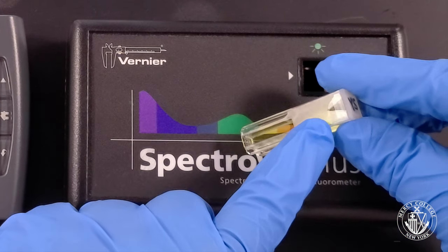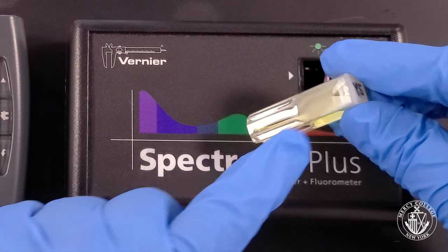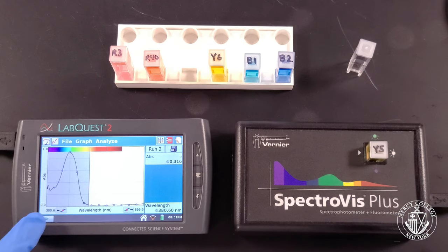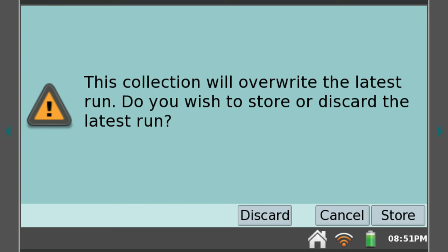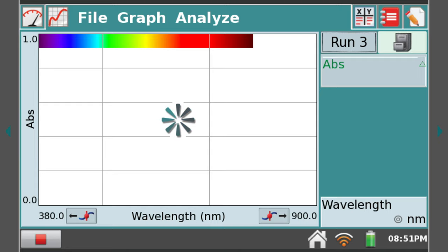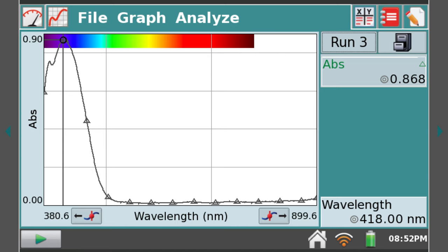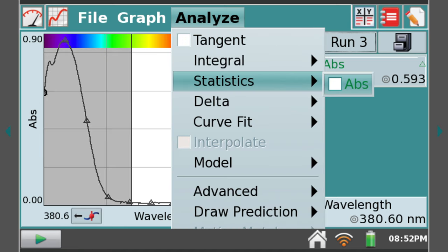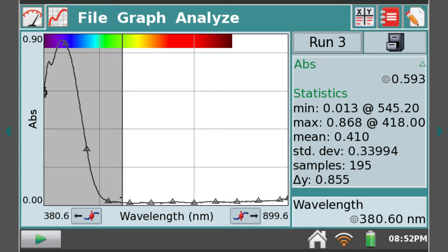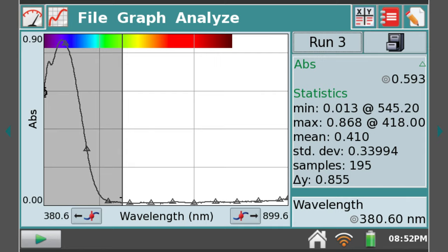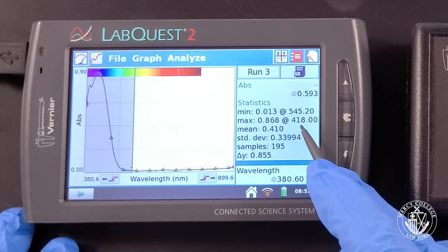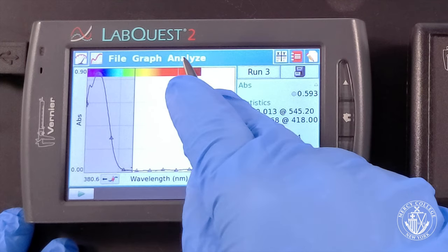Insert your next sample into the spectrophotometer, again making sure the arrow on the cuvette aligns with the arrow on the spectrophotometer. Collect your new spectrum and be sure to store the old one. Hit the Stop button to complete your data collection. Drag to select your data, and then select Statistics from the Analyze menu. Here we see that this dye absorbs in the blue-violet region of the spectrum, with a maximum absorbance of 0.868 at a wavelength of 418.0 nanometers.